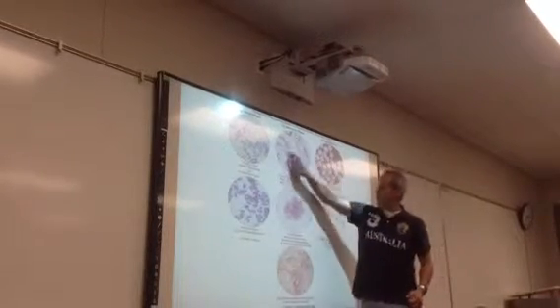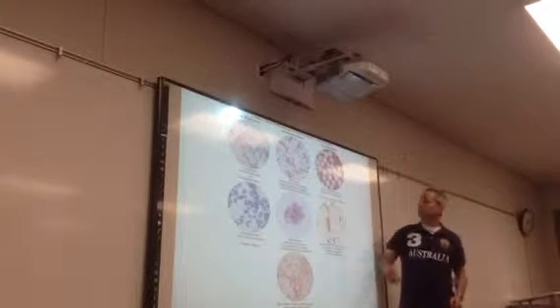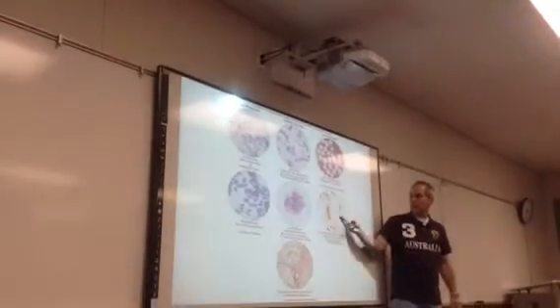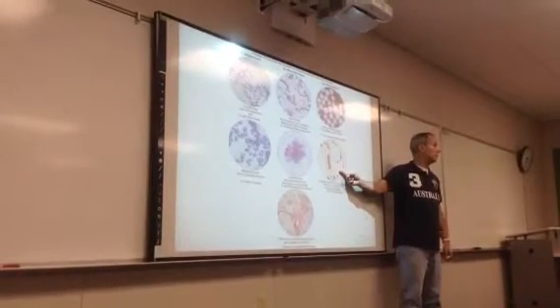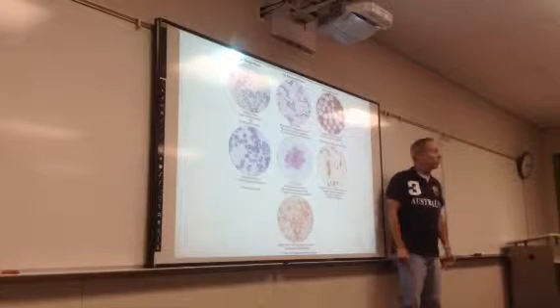I'm going to skip these for 2 seconds because those are the most fun. I'm going to come to these last. We'll talk about these next. Look at these special stains. Do you see why this one's called a flagellar stain? Do you clearly see the flagella on that organism?